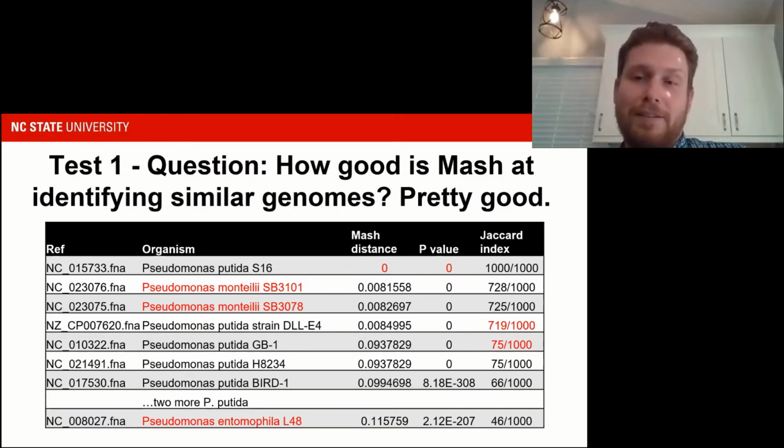So the p-value is dependent on the probability of the random k-mers appearing in genomes and the size of the sketch. We will talk more about what a sketch is shortly, but here you will notice the list of matching organisms found with MASH is similar to what we found with FastANI.